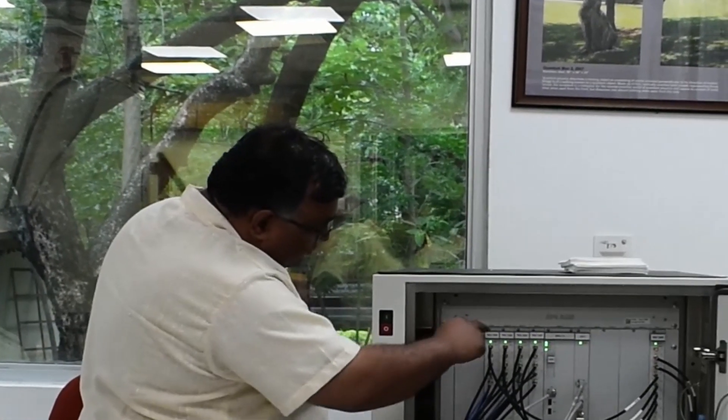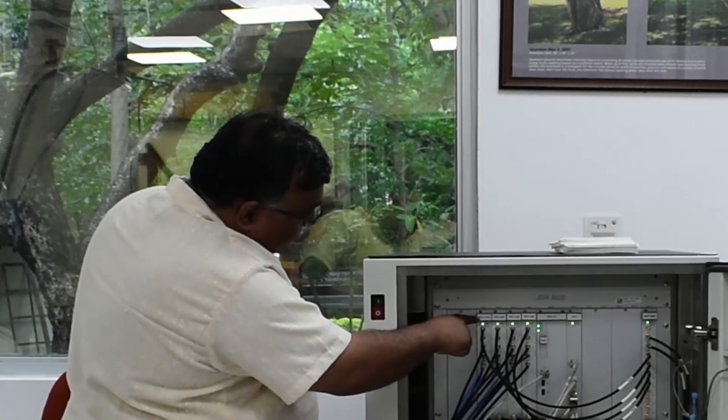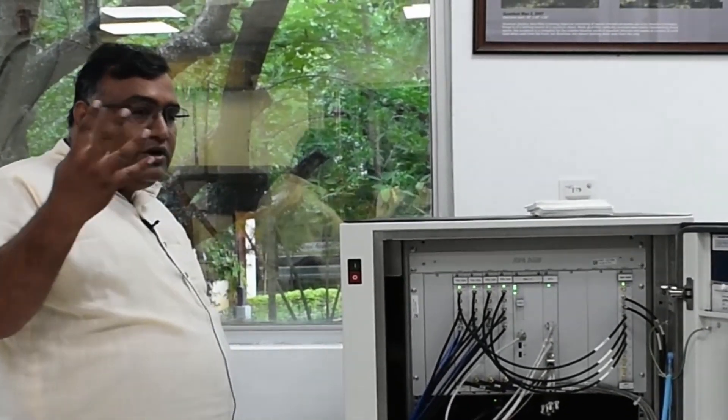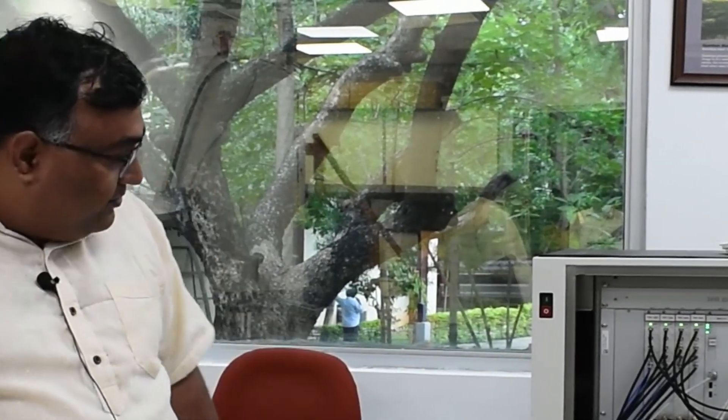And the fact that we have got four channels here, TRX, this is one, two, three, and four. This is essentially four nuclei we can detect at the same time. We can excite and detect at the same time.